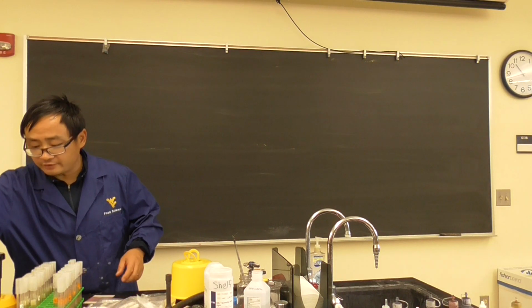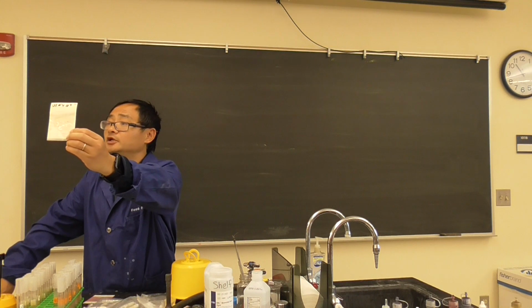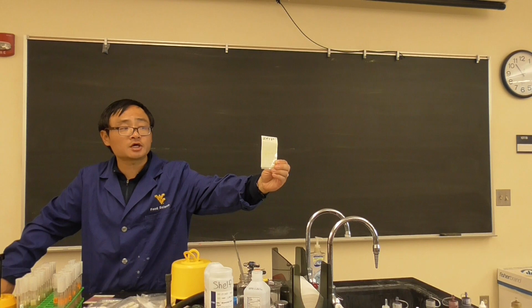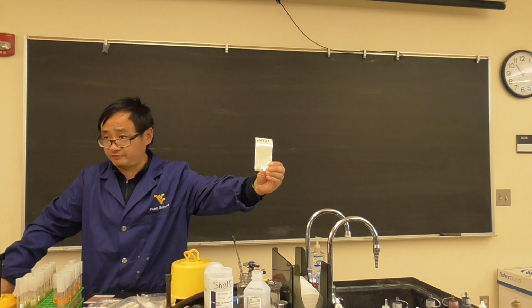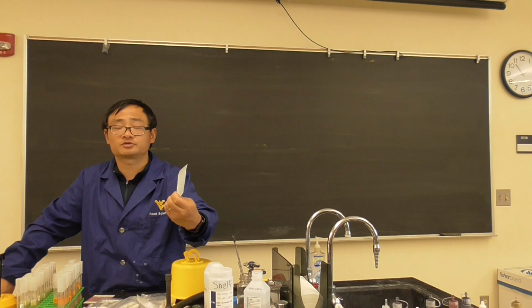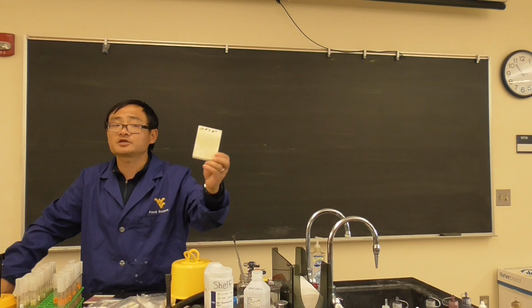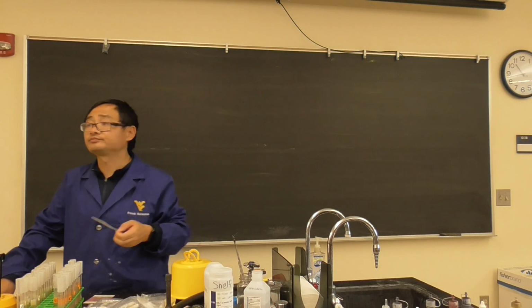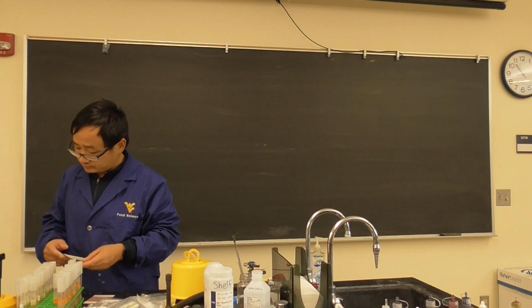And I don't think you have any problem about APC. This is APC. You have red pink dots on the petrofilm, that is APC. So you can go ahead and count how many there are, then multiply by the dilution factor. And you have two petrofilm, one is 10 to the minus second, another one is 10 to the minus fourth. So obviously the 10 to the fourth should be countable, and the 10 to the second might be a lot. Okay? That is easy, not a problem.